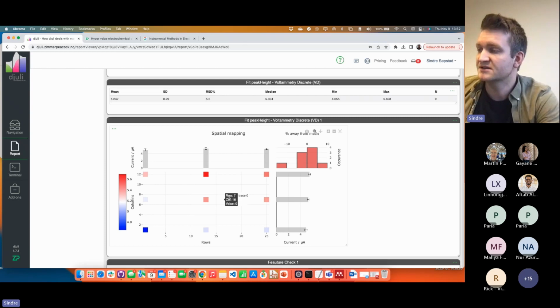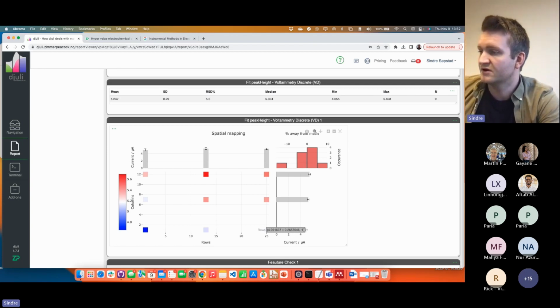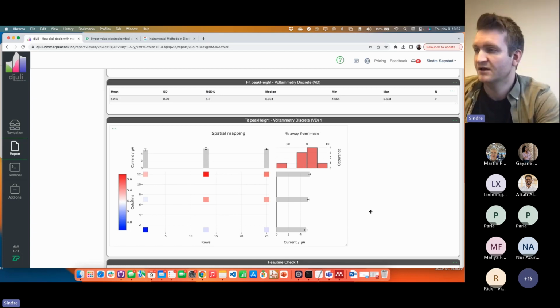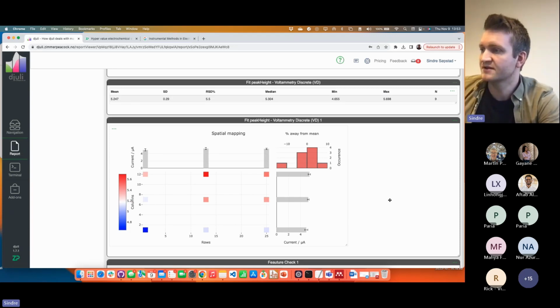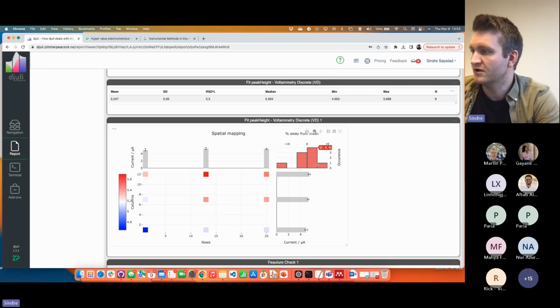If you look out to the sides, here we have the rows summed up. So the average plus an error bar, which represents the standard deviation. You can see on this row, we're a little bit higher. It's around 5.5 as compared to the lower portion of this sheet, where we are around 5. So that could indicate that we have a little bit of a trend. Maybe the electrode area is greater, for example, on the top. Maybe we have a thicker print. Maybe there's some kind of systematic event happening during our print session that we can address. And this here is the overall distribution plot.